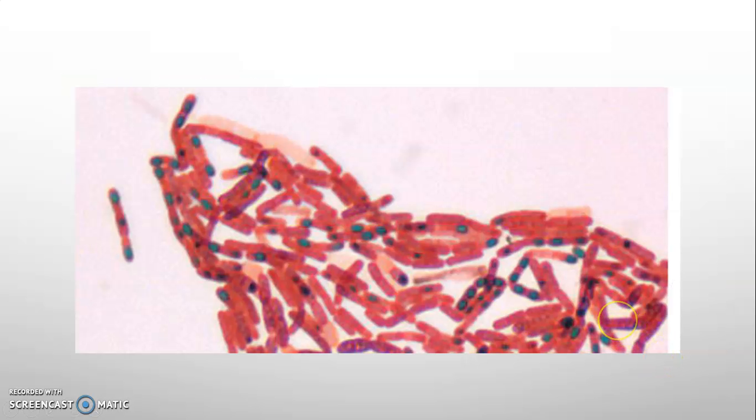So this is what this would look like in a real setting. I mean, we definitely see a few whole vegetative cells that did not produce any endospores, probably because they didn't feel threatened or maybe they're not able to produce endospores. But we can definitely see some vegetative cells over here that have produced endospores. We see the endospores within, so we know these bacteria are definitely in a harsh environment and they're kind of in survival mode. And again, the more time that goes by, the less we'll see of this pink and we'll start to see just the green.